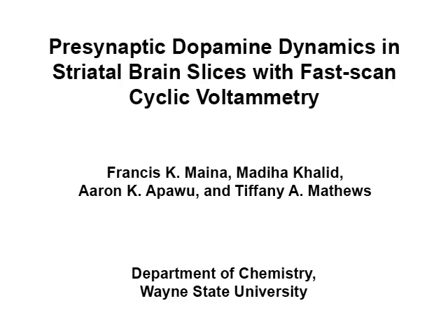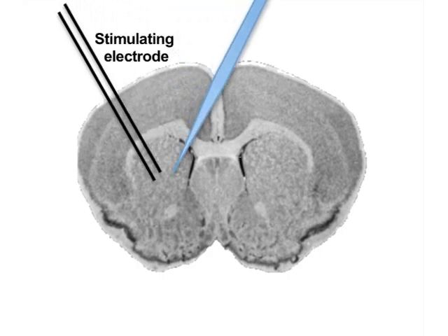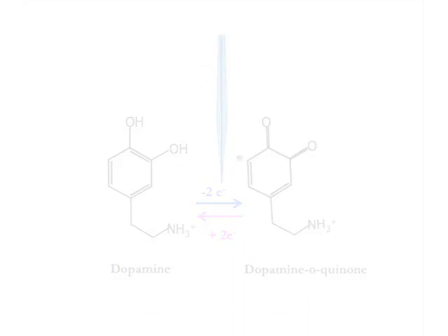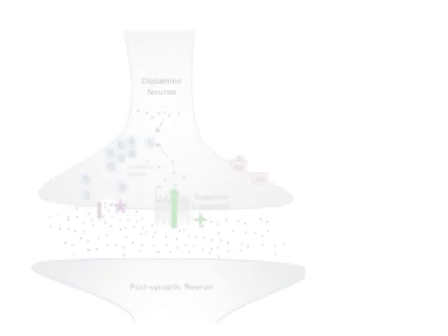The overall goal of this procedure is to illustrate a general protocol for slice fast scan cyclic voltammetry. This is accomplished by first preparing the brain tissue for coronal slicing, then electrodes are placed onto the discrete brain region of interest. The next step is to deliver voltage as a triangular waveform through the electrode to detect dopamine. Finally, a pharmacological agent of interest is applied to the brain slice and its effect on presynaptic dopamine dynamics is observed.